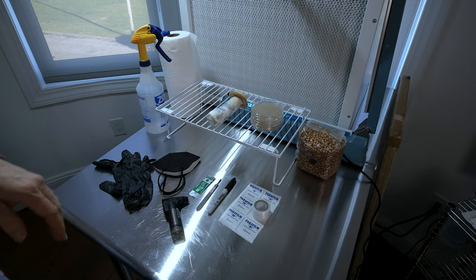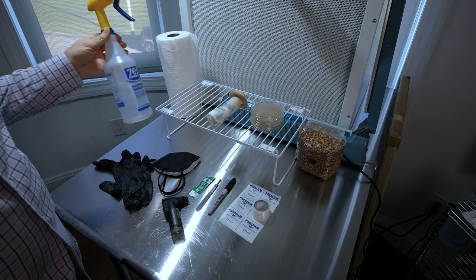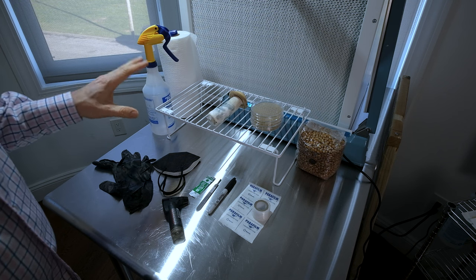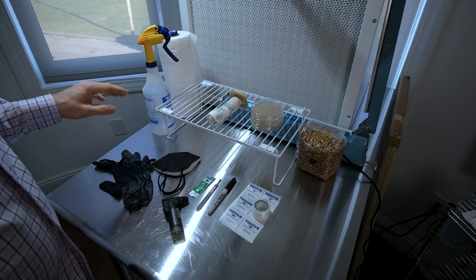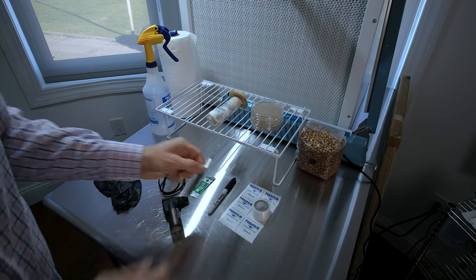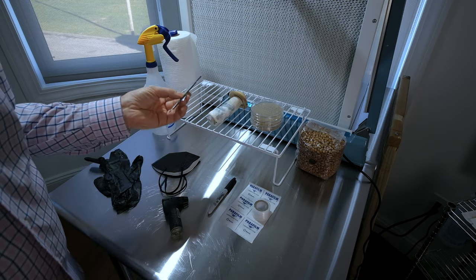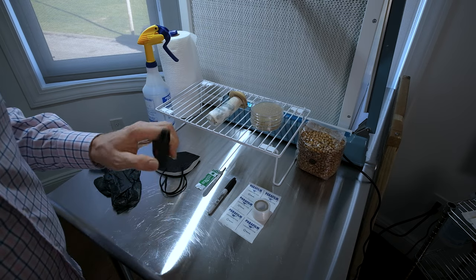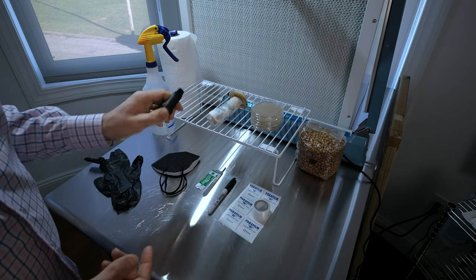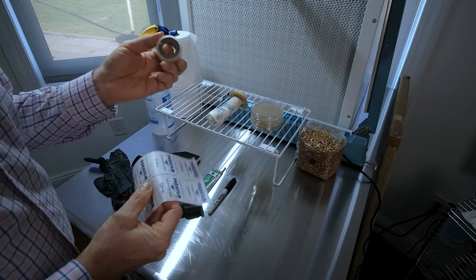You're going to need a spray bottle with 70% isopropyl alcohol. We use 70% because it doesn't evaporate as fast as 99% — it gives the alcohol time to break down the cellular walls of bacteria. You'll also need gloves, a mask, paper towels, a scalpel — I like the number 11 size blade personally, though you can use an exacto knife — and a heat source to flame sterilize your blade; torches make quicker work of it than a lighter.